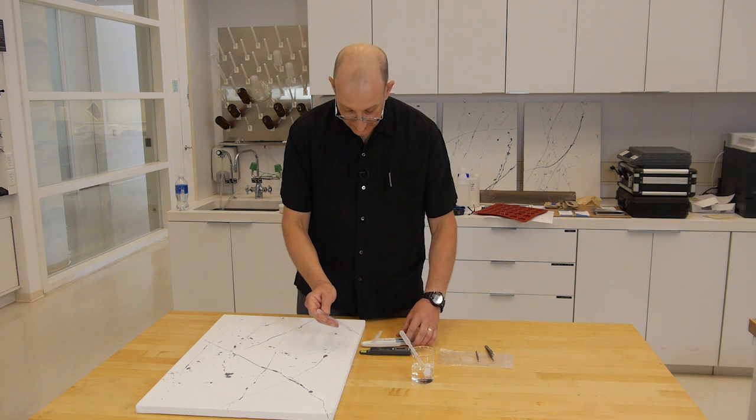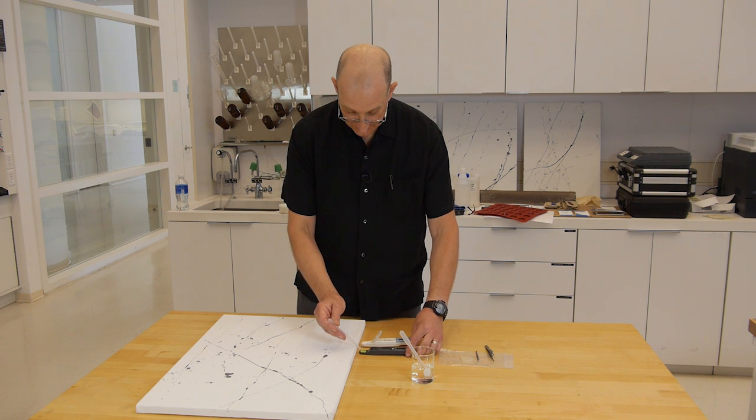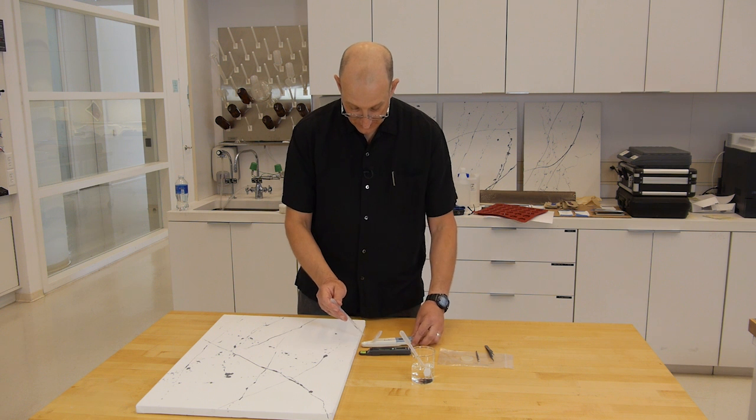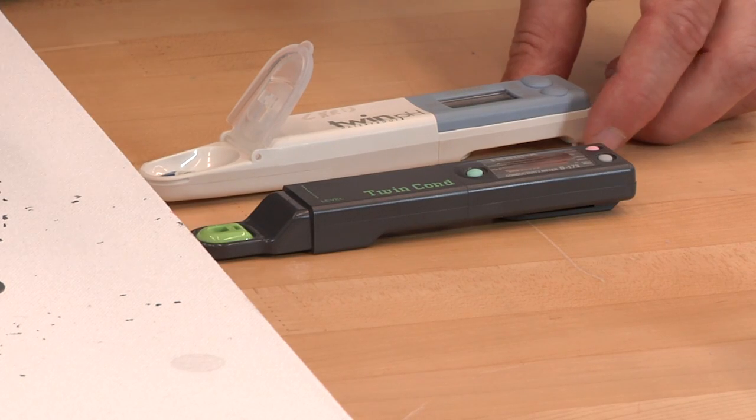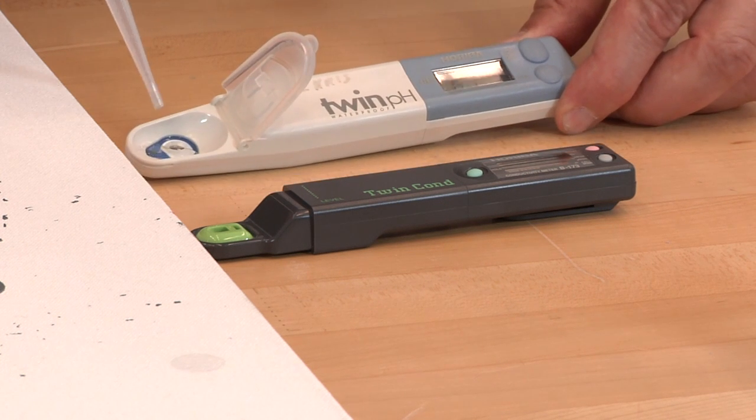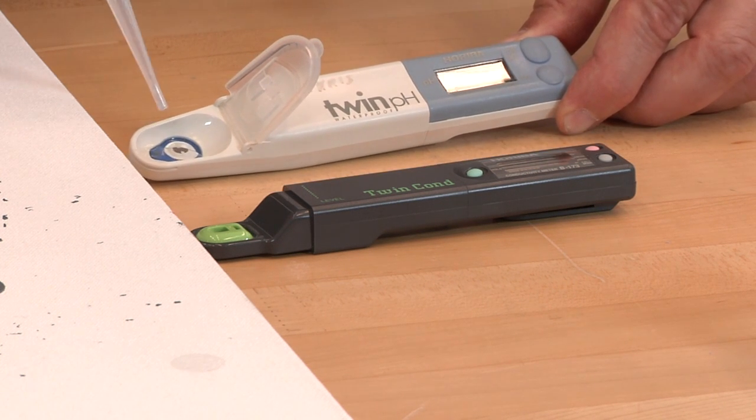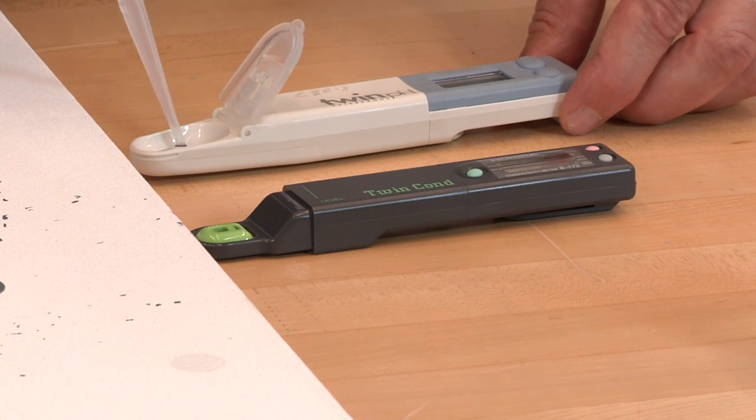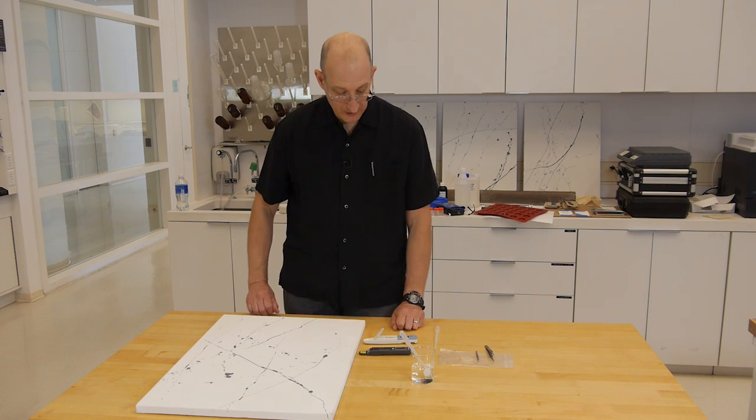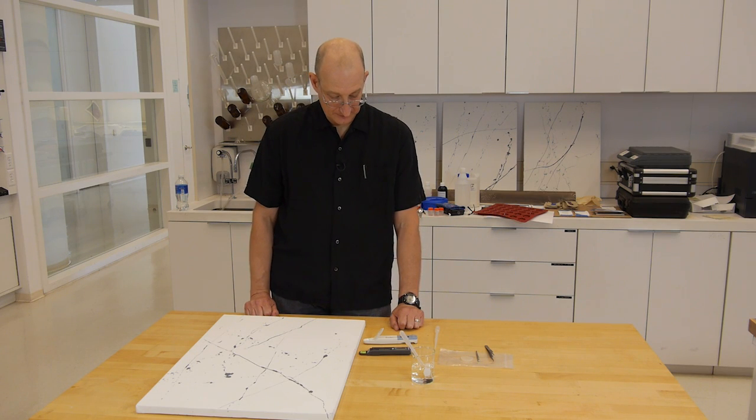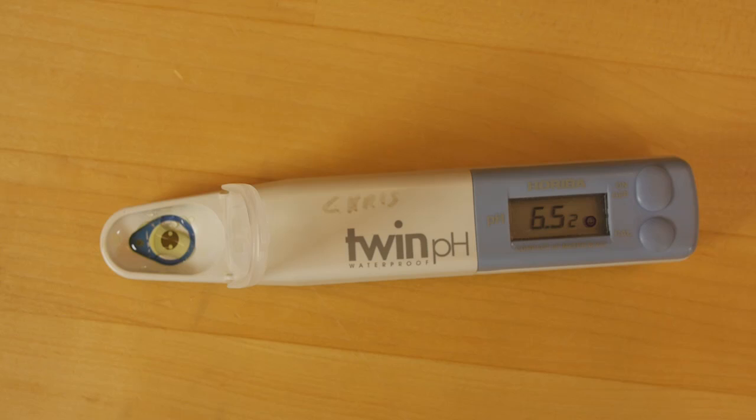Now we take that drop of water out and put it onto the pH meter. As with the calibration step, we want to make sure that we have both the measuring electrode and the reference electrode dampened and in contact or bridged by the water. Again we wait for a happy face. And we have our happy face, and our pH is 6.52. So we've determined both the pH and conductivity of this surface.